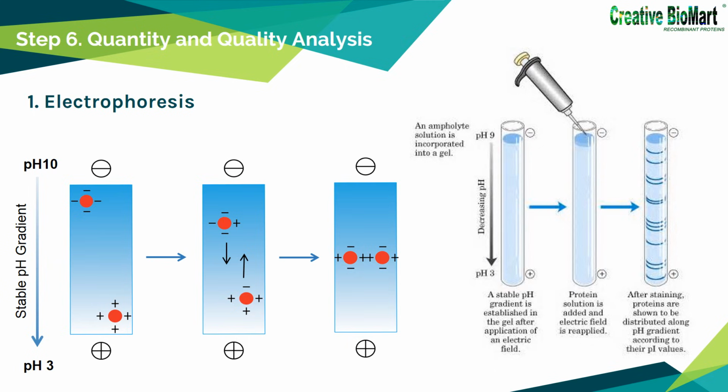In case some proteins have a similar weight to the target protein, we need to run isoelectric focusing first. Isoelectric focusing can be combined with SDS-PAGE to obtain very high resolution separations. Proteins can also be separated electrophoretically on the basis of their relative contents of acidic and basic residues. The isoelectric point of a protein is the pH at which its net charge is 0.